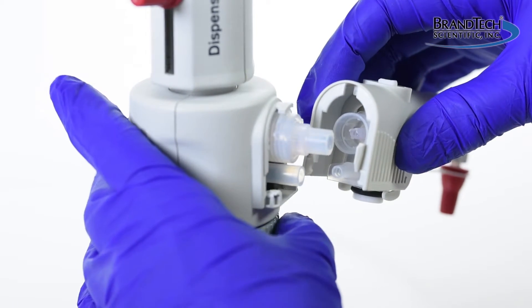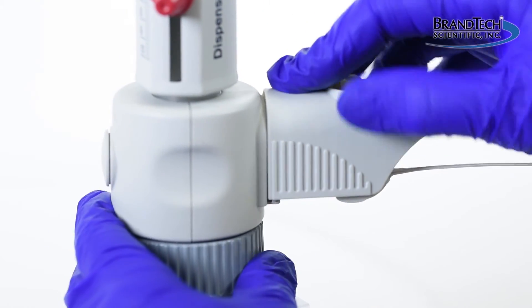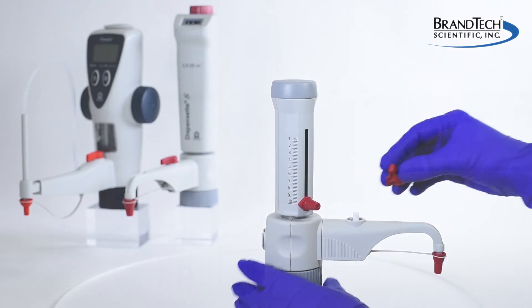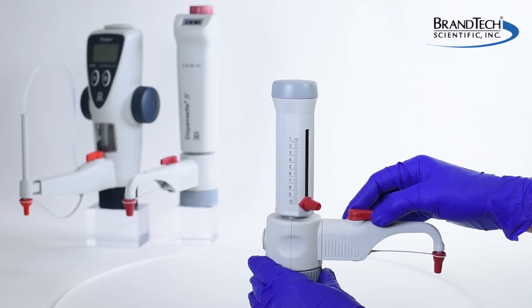To install the discharge tube, slide it into the valve block until it's flush against the instrument. Slide the discharge tube housing down. If your instrument has a recirculation valve, reinstall the valve lever.